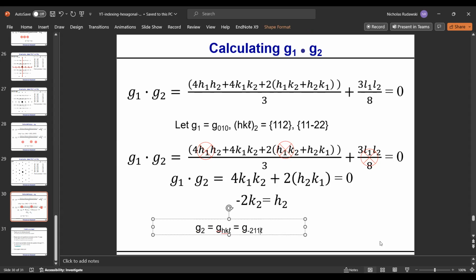I end up with 1, and then I have 2. So this is inside of the family. Mathematically, this works. This is a viable solution, so this could be the solution. What we need to do, though, is, because we have that other hit in the table, go ahead and see if we can't rule that out.